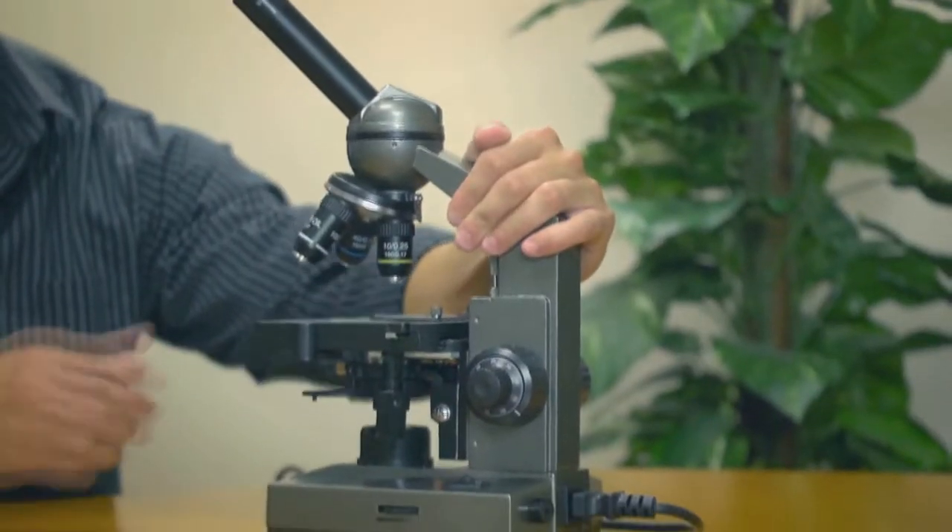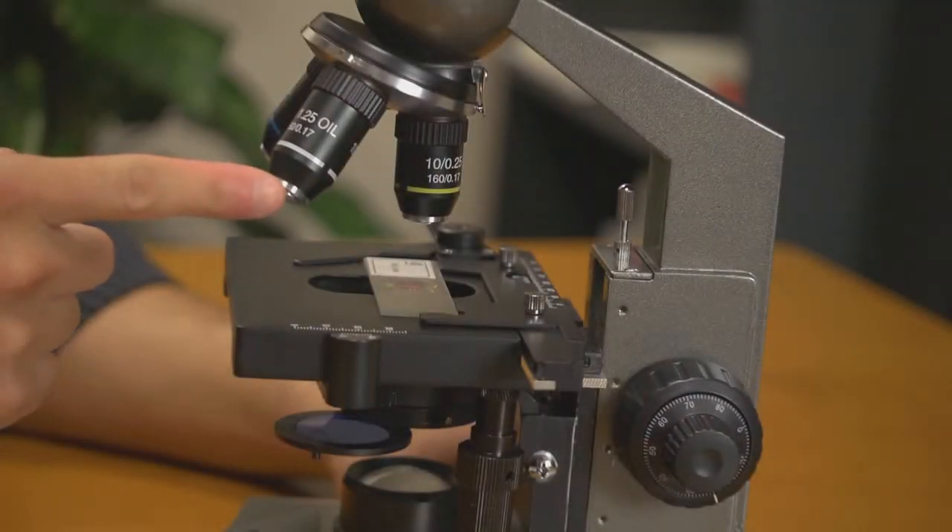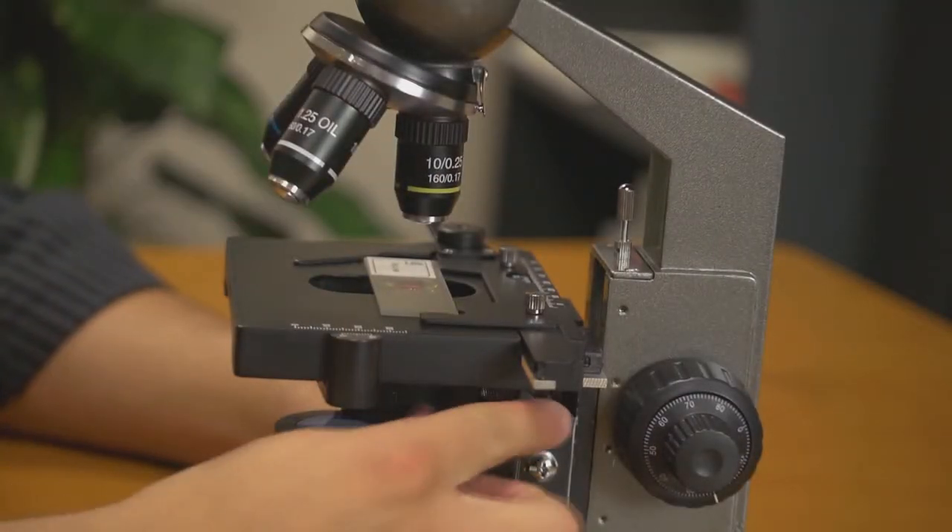Hey, what's up guys, this is Doug from Carson Optical. Today we're going to check out an advanced biological microscope that's great for high-powered inspection and biological research. The MS-100 is built with an all-metal frame and a super sturdy base. It features full glass lenses and even a mechanical stage.